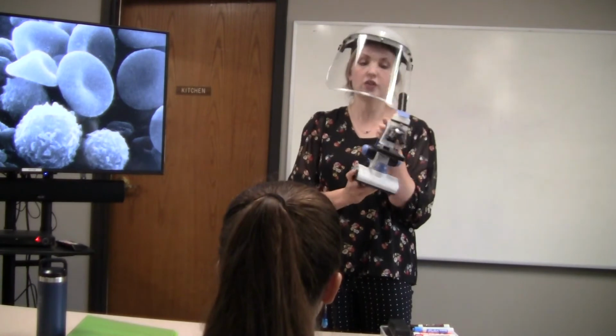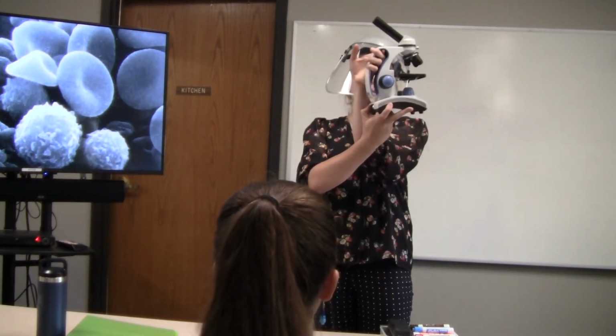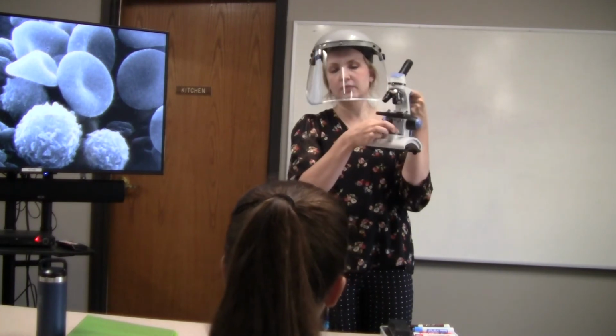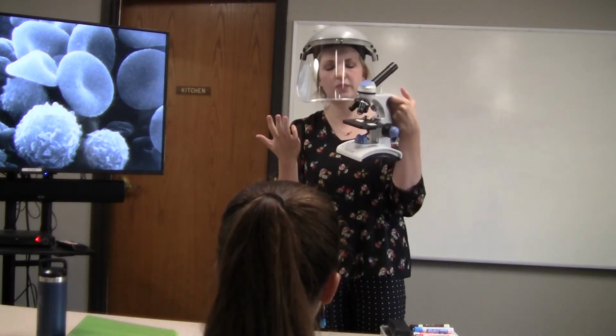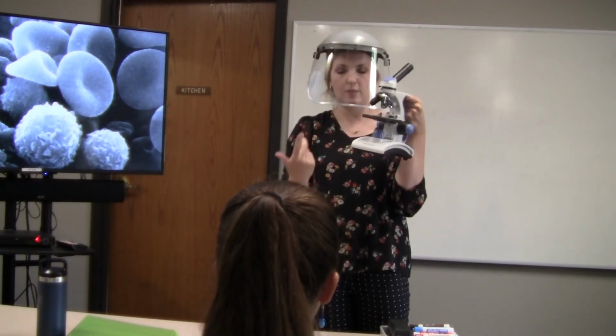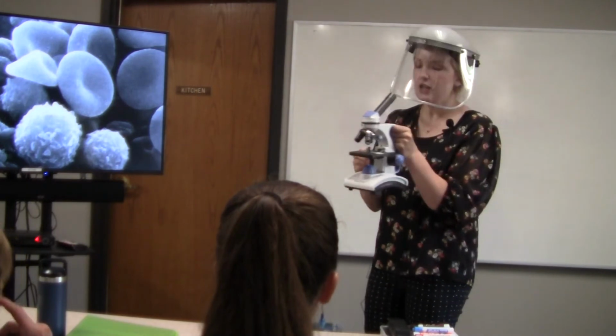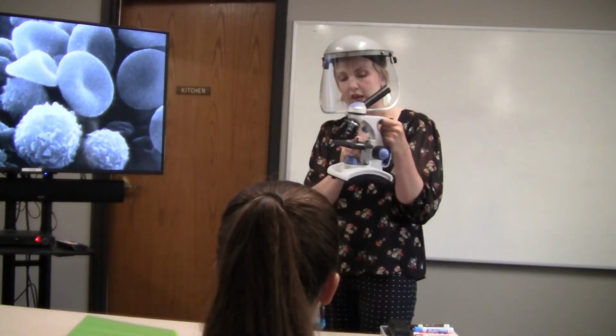You obviously have to turn the light on. Some of these have two light sources, an upper light source and a bottom light source. You want the bottom to be lit up, not the upper one. That will flood things out. There are certain scenarios where that's helpful, but most of the time we just want the bottom one lit up. Then you'll use the adjustment knob. Doesn't really work well with my face shield on.